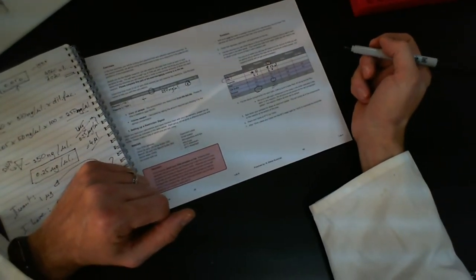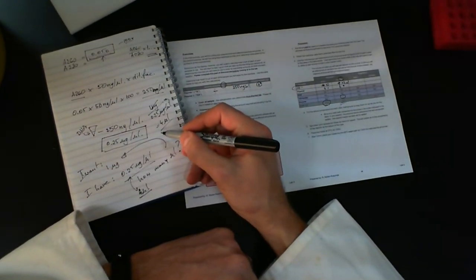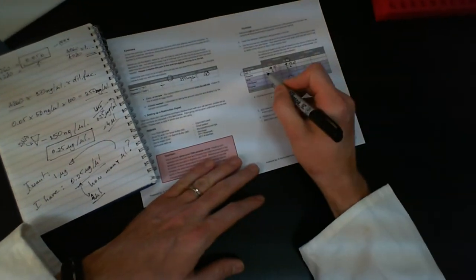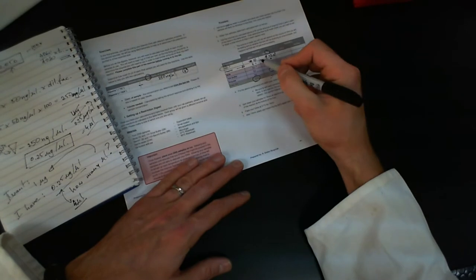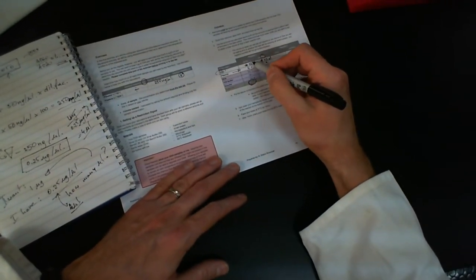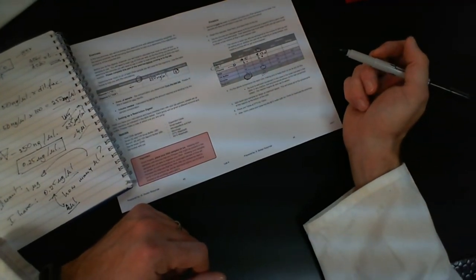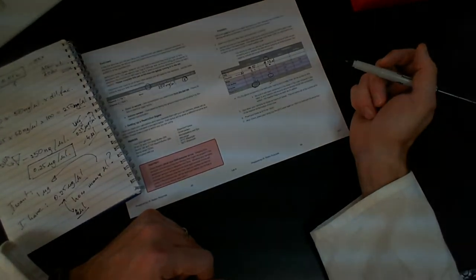So again, based on the numbers you get from this, you are going to figure out this number here. This number goes into this row on this table. Once you have that, add these up and subtract from 20 to give you the amount of water you need so that you have a total volume of 20 microliters. Hopefully that helps you figure out how to prepare for this lab.